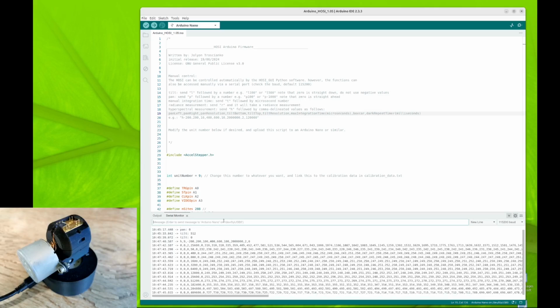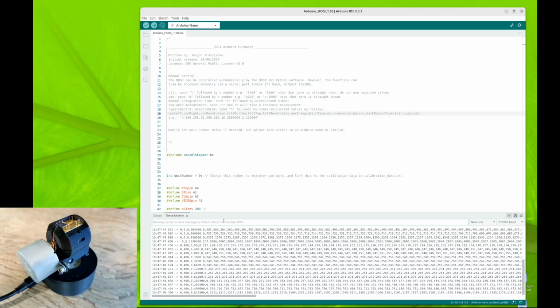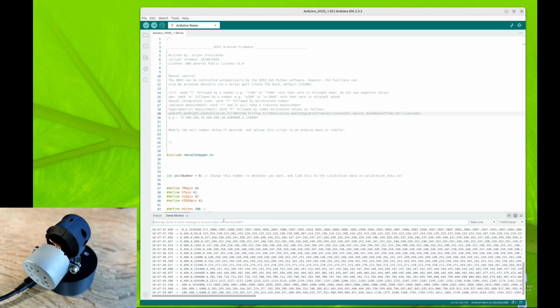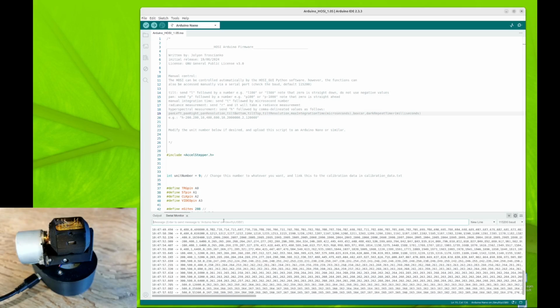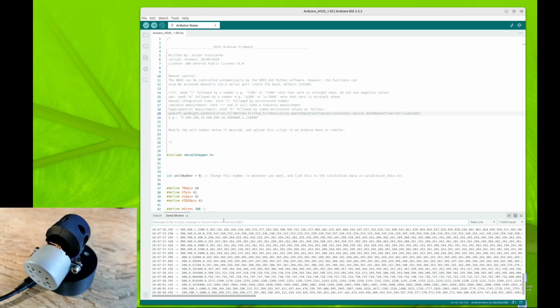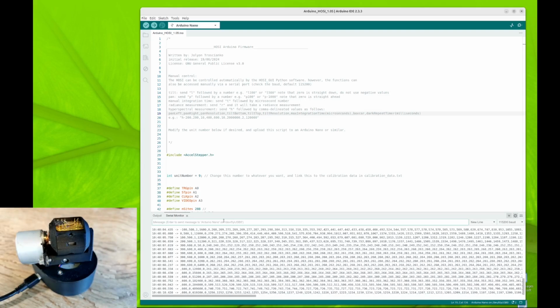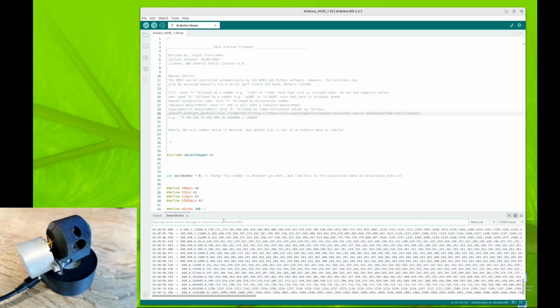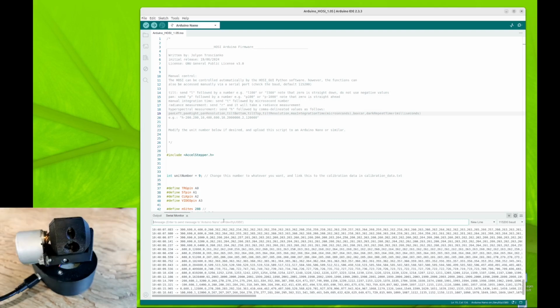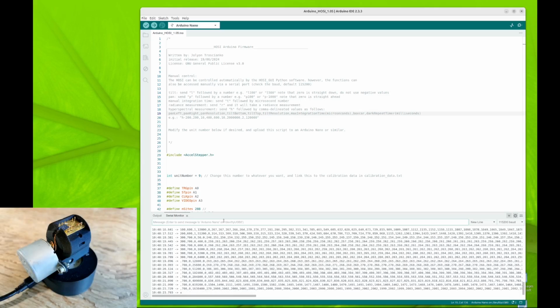First it just initializes the spectrometer and takes a dummy reading to sort of clear out the sensor. Now it's taking dark measurements at different integration times. Now it's actually scanning. See, it's moving around. And there we have it, done. So it's given a little X at the end to show that it's finished.